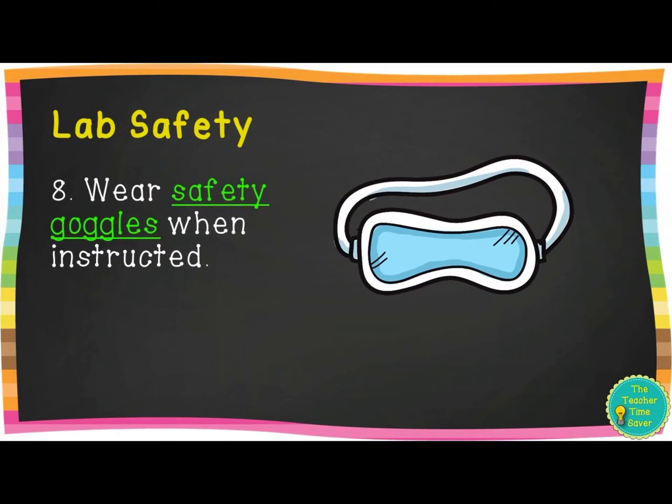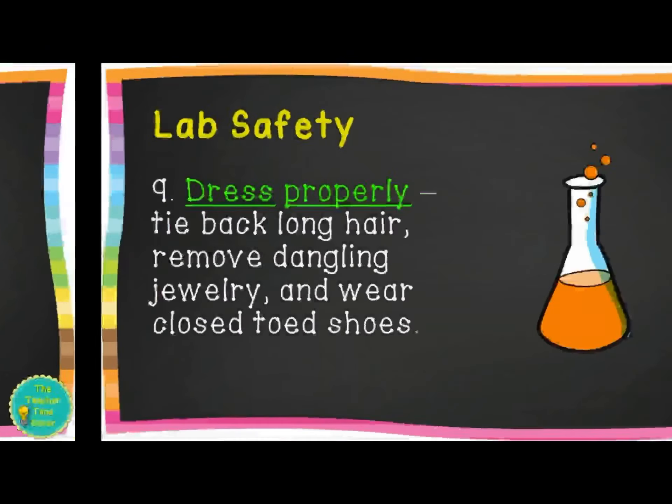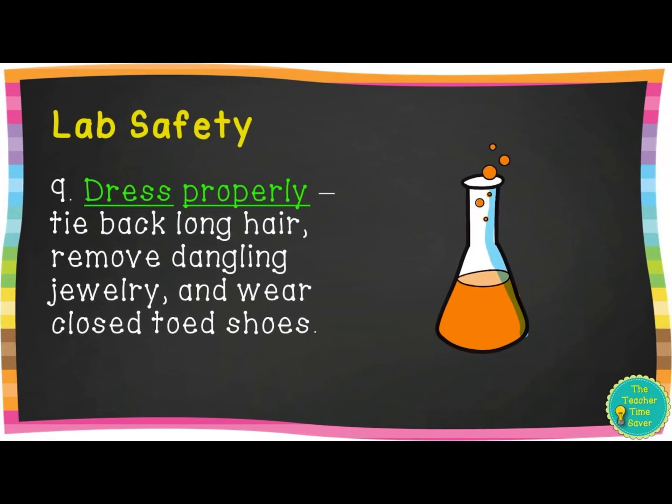Rule eight: wear safety goggles when instructed. We're not going to have safety goggles for this course, but in many future labs you'll have to wear them. Rule nine: dress properly — tie back long hair, remove dangling jewelry, and wear closed-toed shoes. You won't need closed-toed shoes in my lab, but you will need to tie back your long hair and remove dangling jewelry so it doesn't fall into what we're working with.